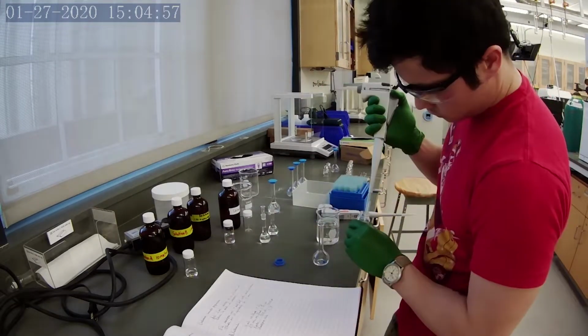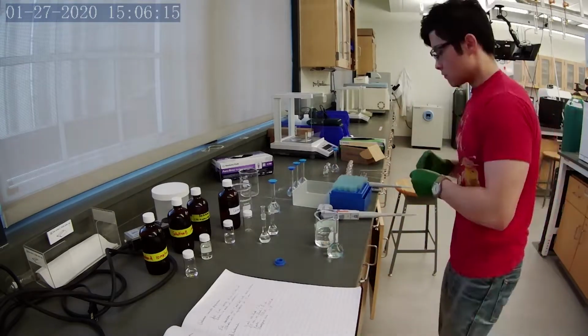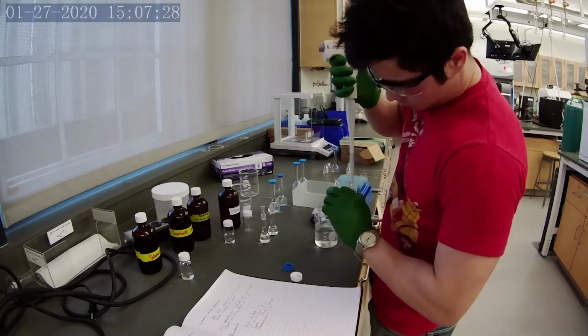And then after that we're doing calibration standards at 0.2, 0.4, 0.8, 1.2, and 1.6 mg per mL of ethanol, and adding 2 milliliters of the propanol solution as internal standards.